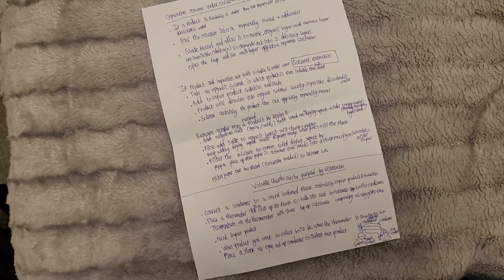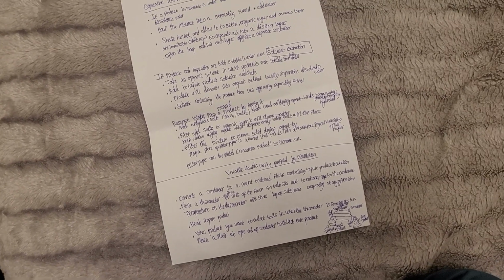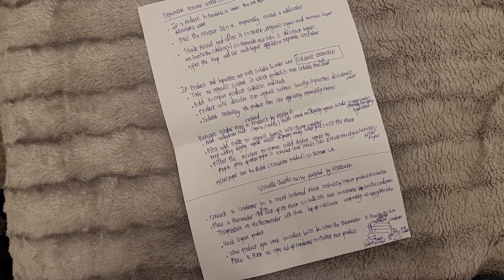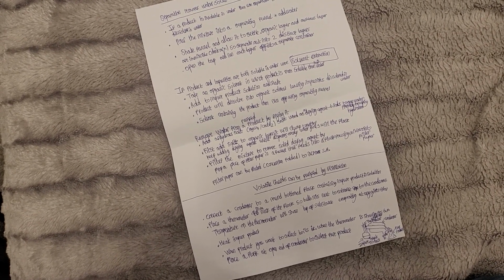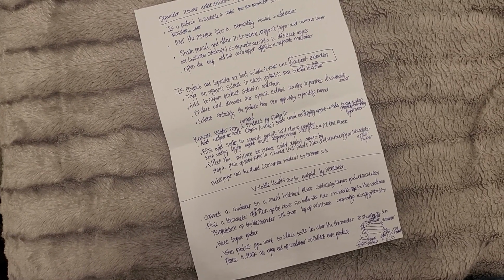Volatile liquids can be purified by distillation. You want to connect a condenser to a round bottom flask containing the impure product in solution. This is for volatile liquids, remember. Place a thermometer in the neck of the flask so the bulb sits next to the entrance of the condenser. The thermometer will show the boiling point of substances evaporating at any given time.